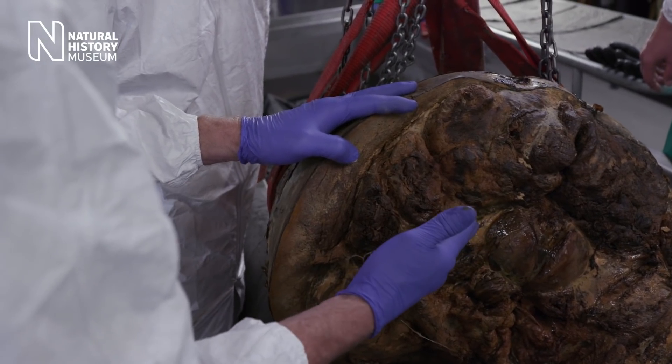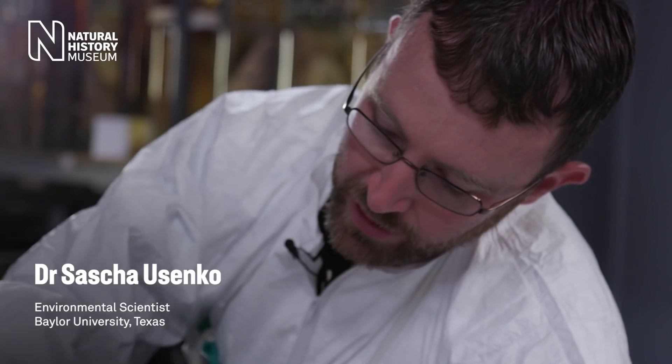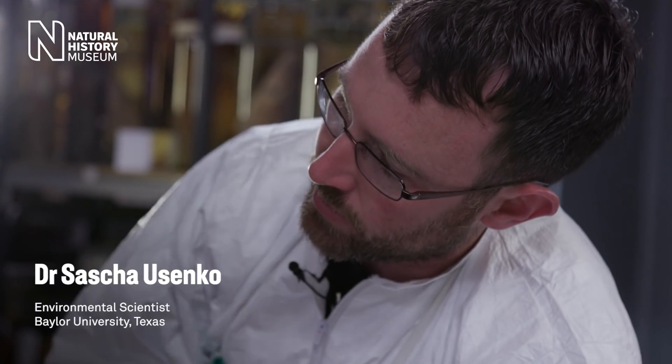The earplugs are going to sit right about here. We're going to have to cut some tissue, but this is very preserved — it's going to be tough to get through. We'll remove some of those external tissues and then see where we're at.